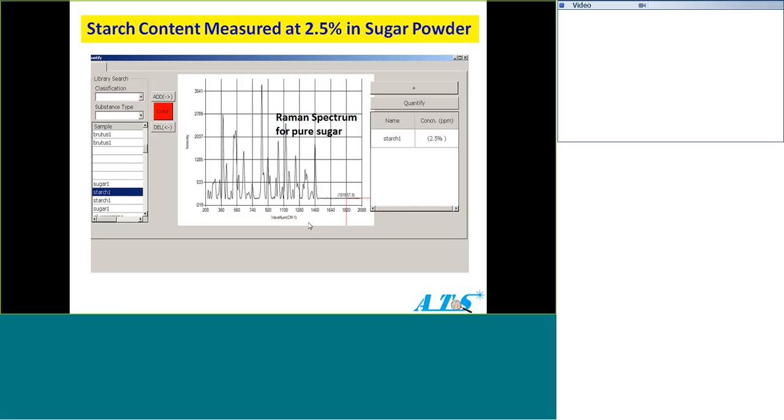Yes, understand. But this is because it's spectroscopy, you know, it's an optical thing. It's very, very easy to calibrate. But not like HPLC, where instrument to instrument it is impossible to make the same data. Retention time will shift. You have a method developed in Florida, and I have a method developed in New Jersey, same sample, but the column changed too. So how can you get it to be the same?